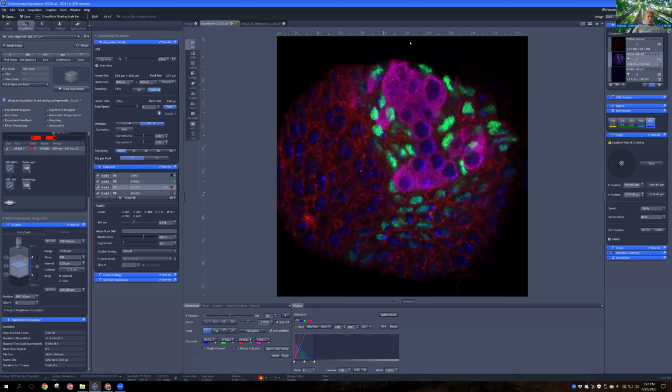Astronomers use XY for the sky and Z for the line of sight, which is exactly what. Exactly. Yes, unlike in biology, astronomers don't get Z information. It's a very important distinction. But there's another parallel. You've got this expensive piece of equipment that you talked about, and astronomers have expensive bits of equipment. And in general, you don't want to let human beings touch these pieces of equipment, right? So you have computer controls, which is so nice for Shadow the Scientists. You can share your screen. That's a parallel I see.